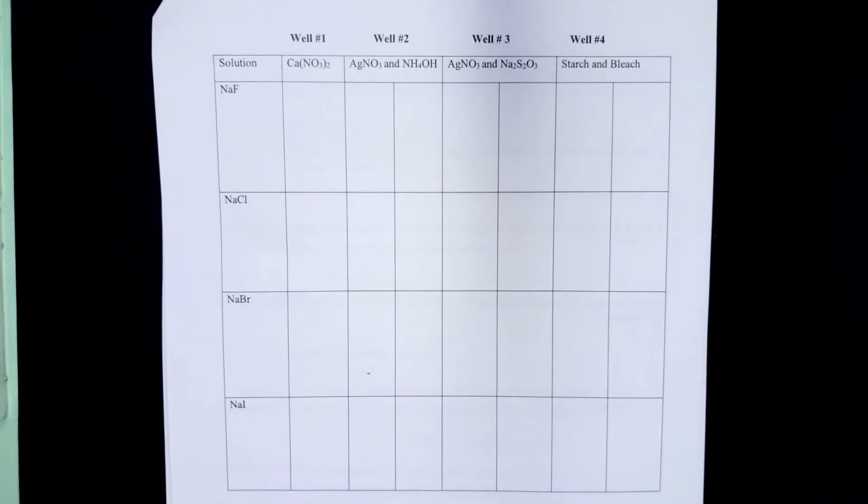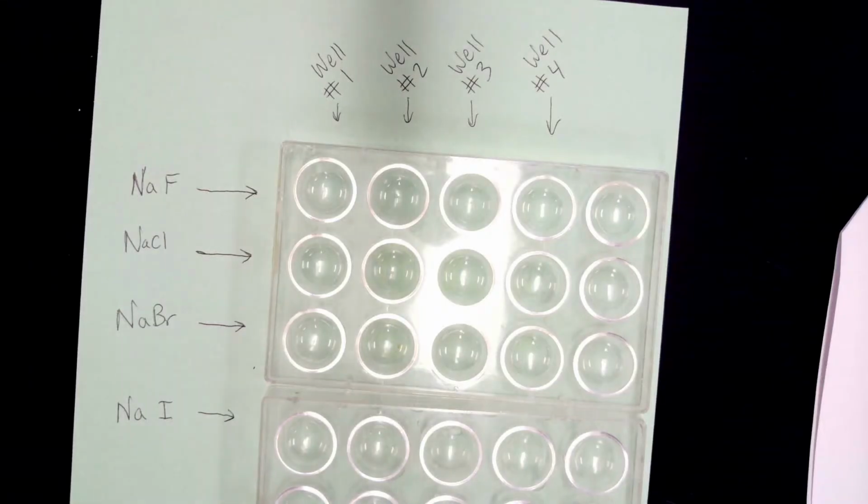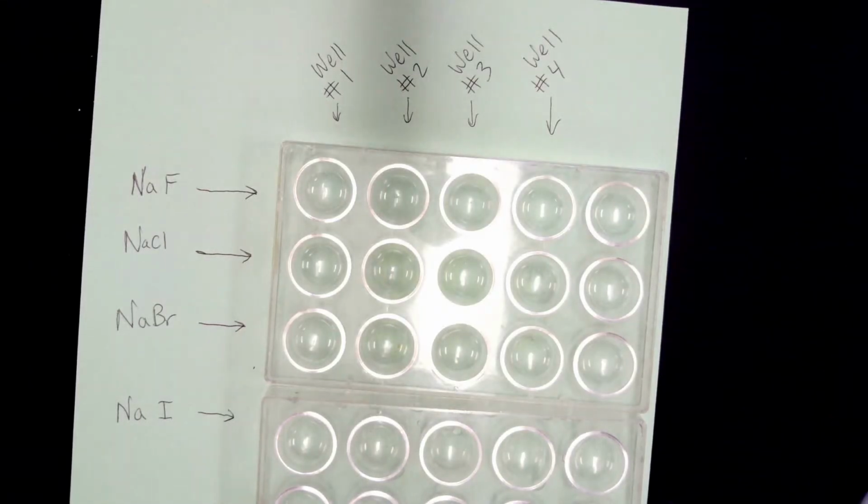And what we're going to do in this lab is fill out this table. So I'll walk you through this. We have a 4x4 grid here, and we're going to mix the chemicals and record if there's a precipitate. So you can put PPT if there's a precipitate, or NR if there's no reaction.